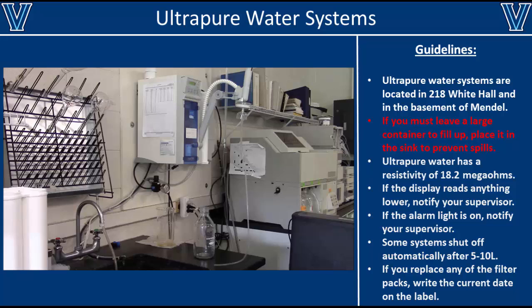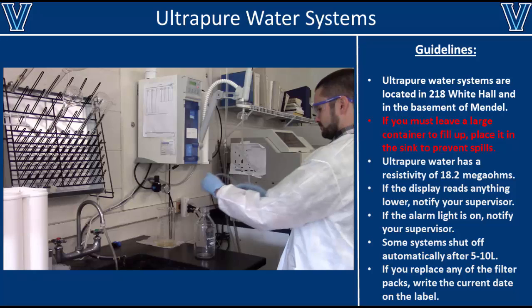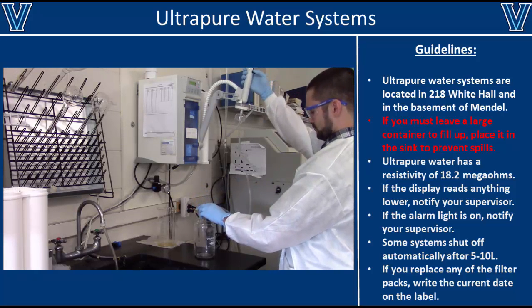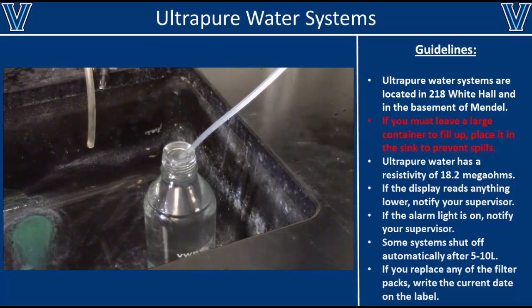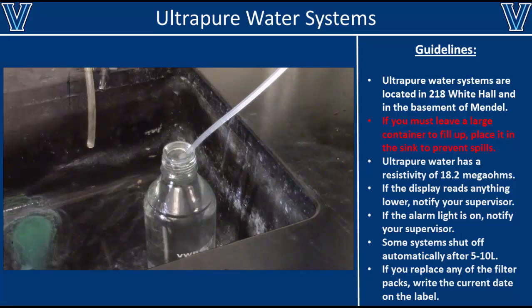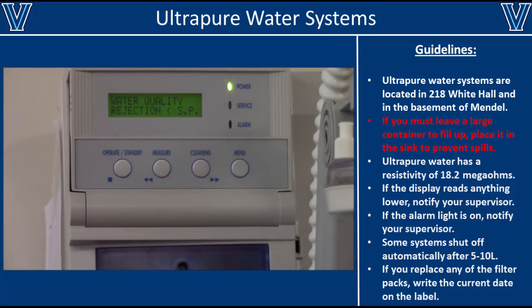Another commonly used piece of equipment in all of our labs is the ultrapure water system. Ultrapure water should be used for all of your buffers, since tap water and even distilled water may have some contaminants that could interfere with your reactions. To collect ultrapure water, place the dispensing hose inside your bottle and pull the trigger as shown here. Do not let bottles fill up on the bench. Instead, put them in the sink just in case you forget about them and they overflow, as this can flood the lab and damage many expensive pieces of equipment. When collecting ultrapure water, you should always check the readout on the system to ensure that the water is ultrapure.